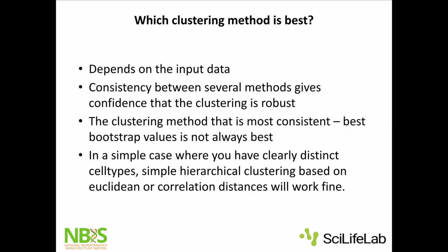To do bootstrapping is, of course, a good idea, but it's also, unfortunately, the case that consistently wrong clustering can also occur, that it's consistent, but it's not biologically relevant. But in most cases, clearly distinct cell types will cluster together regardless of what you do with the data. It's more the within cell type or very similar cells that you might have an issue.